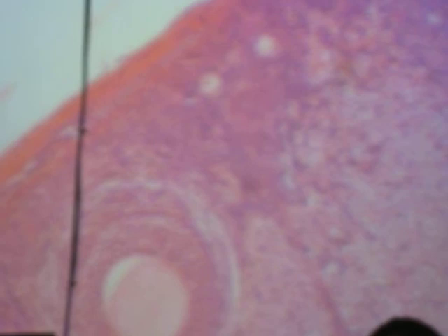Now when you look at the slide, go towards the outer edge of the tissue, and you'll see these small little circular structures. These are known as primordial follicles. Basically, inactive primary oocytes in a dormant state, waiting to be stimulated to activate, to go through a complete meiosis.